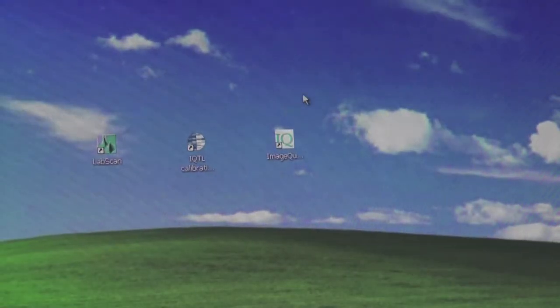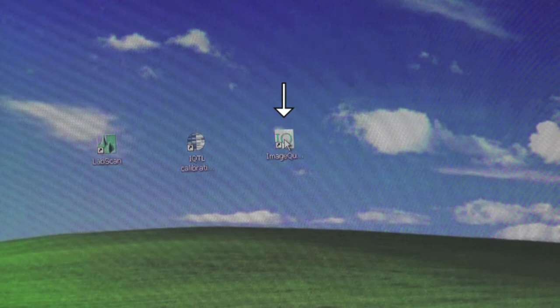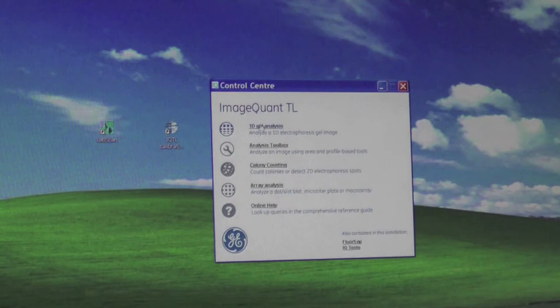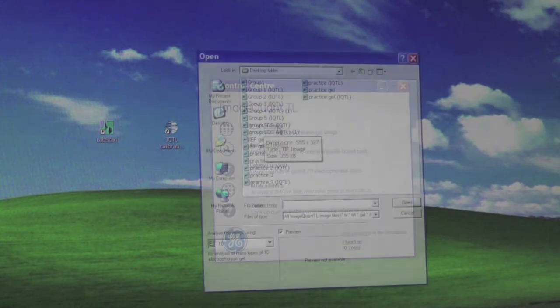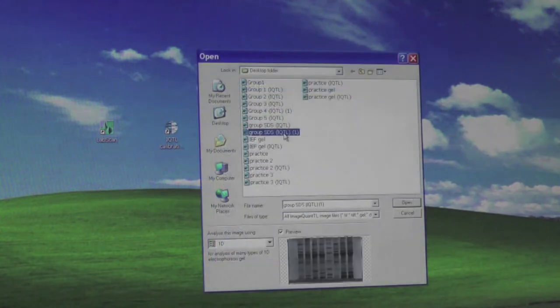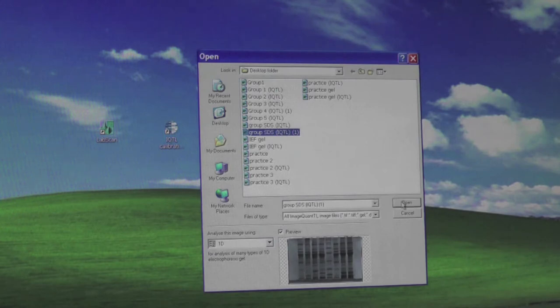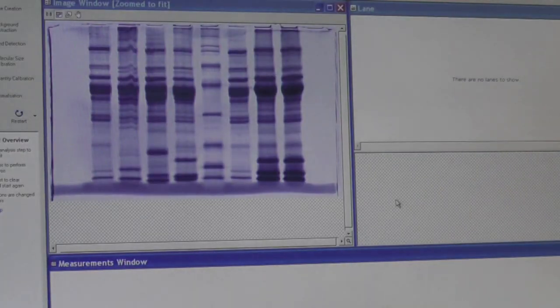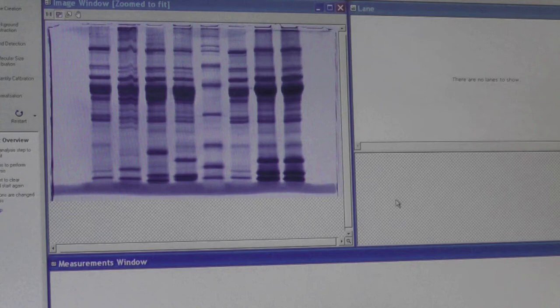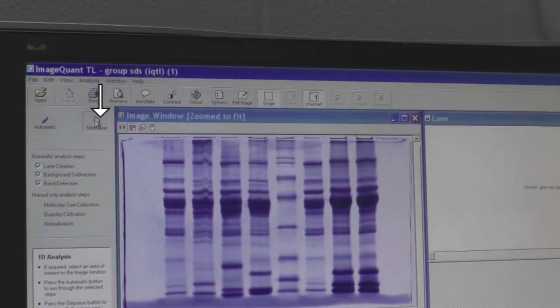To analyze the image of the gel, click on the ImageQuantTL software. Click on 1D Gel Analysis and select your converted photo. The file name of the converted photo should be the original file name followed by IQTL. Open the file. To select and edit the lanes manually, click on the Stepwise icon from the left panel, then select the Manual icon.